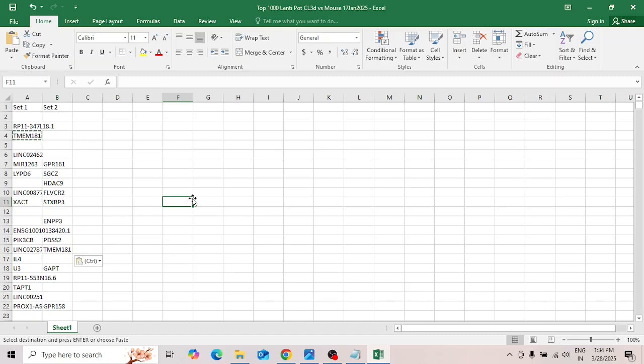In terms of how the file is formatted, really all you need is two sets of columns. And I should also say that the data doesn't necessarily need to be genes. It could just contain labels for parts of a genome. So all you need is two columns, and you do also need a label for each column.